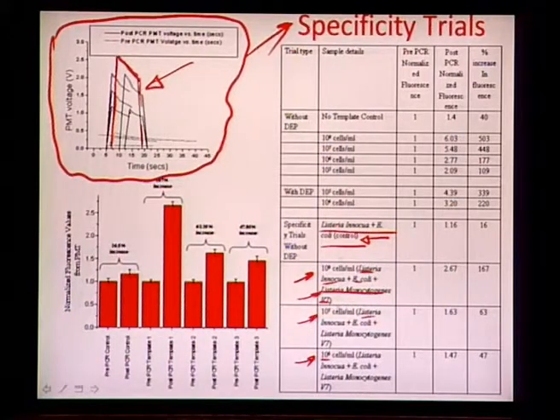So, these are the different strains that you have, and now you undertake a PCR process and study the RT-PCR rate on that. As you see here, between the pre-PCR and post-PCR in the control, the increase is 16.5% with the error bars within each other. So, this is not significant. This is indicative of the fact that because of the absence of LMV7 in this control sample, there is no fluorescence growth, and therefore the primer is very specific.